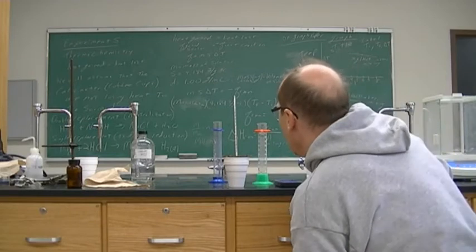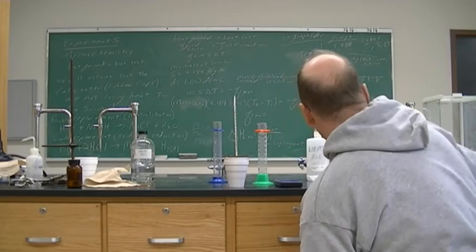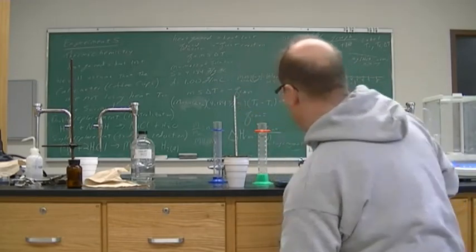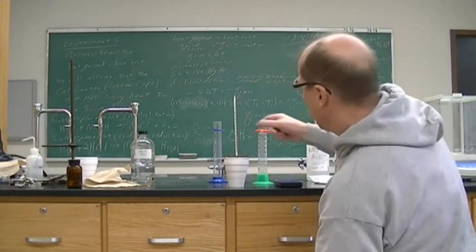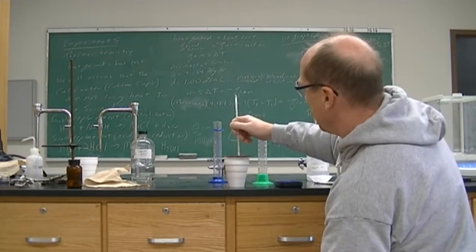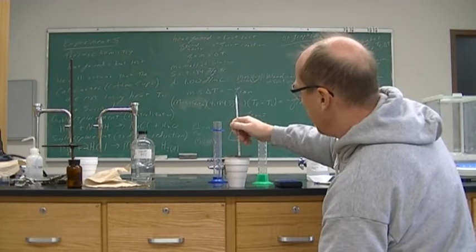All right, 8-minute mark, we are still at 34.2. I do hear some bubbling, but very, very small amounts. So this reaction is about over.